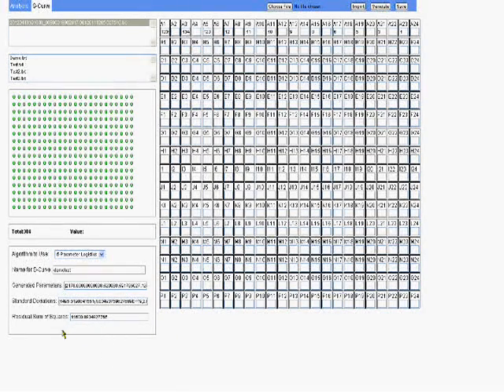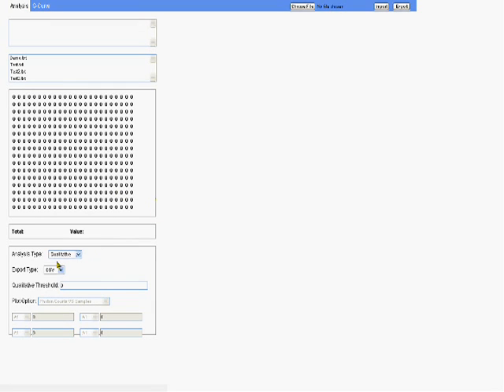So this one and this one, you can see that they have the same residual sum of squares, so the error isn't going to be compounded too much on either one. So we'll just use the one I generated earlier. If you did like this file, you just save it and it would be added to this list, which is alphabetically sorted. And so we'll go back to the analysis tab, and you can select quantitative.